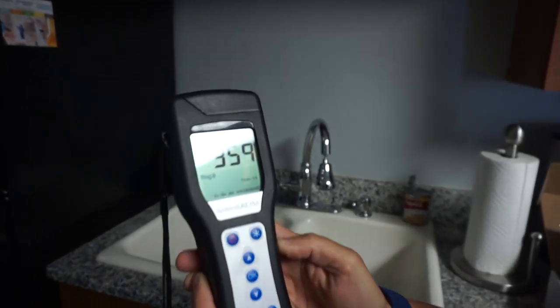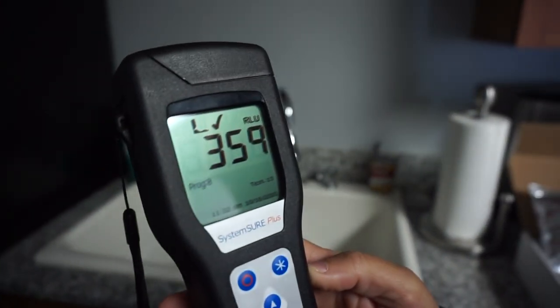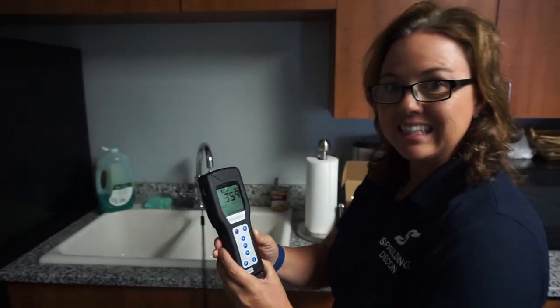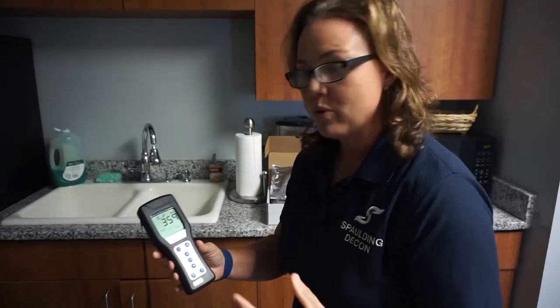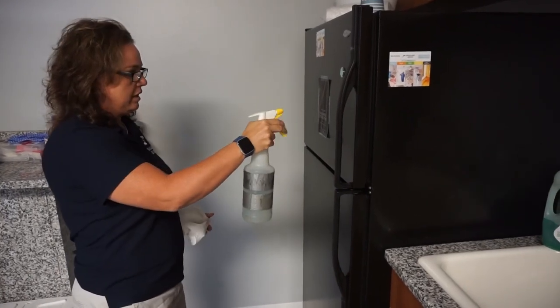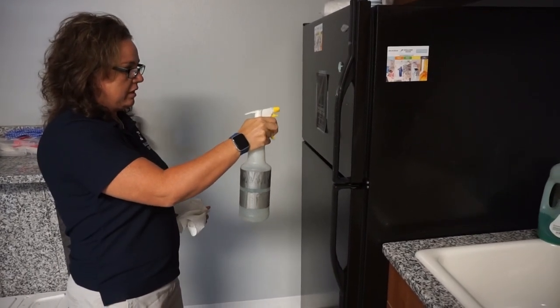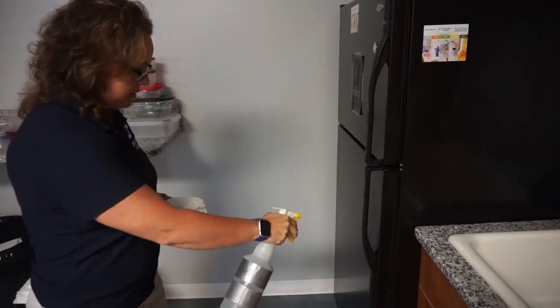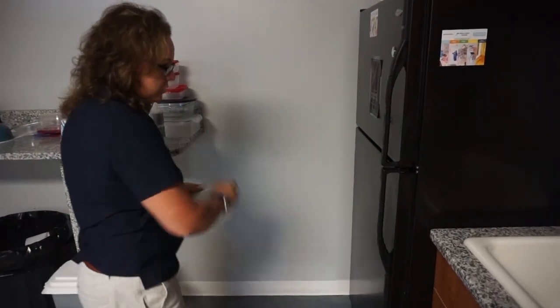Oh my god — 359! Wow. So I'm going to clean it now and then we're going to retest and see if we can get it closer to 30. I'm going to put some Shockwave here — oh boy, this handle is no bueno.